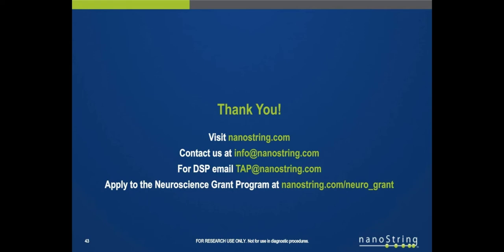So the RNA input really depends on your sample type and what genes you're looking at or which panel you're working with. But in general, the range is anywhere from 25 nanogram to 300 nanogram. I would say our standard input for these neuro panels is 50 to 100. And I can say already that I've seen really robust counts coming off of these sample types on these panels. So, in a very general sense, I would say 50 nanogram is a great starting point.